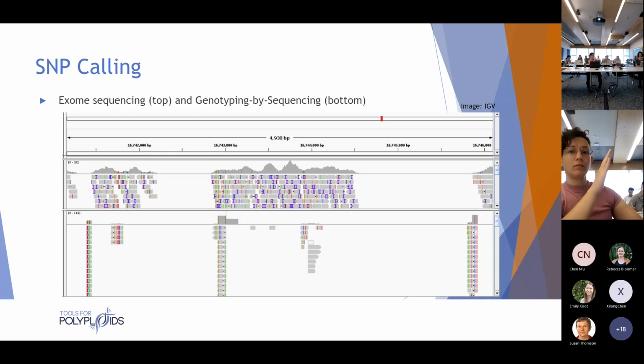What happens is there will be overlapping sequences, but only at the enzyme cut site, and they will be very close to each other. They will be considered duplicates because they start and end in the same position. This is important information because it will need to be handled differently compared to the other processes. In the other ones, the reads don't start and end in the same position, so they are not duplicates, and usually the duplicates are removed from the process. For GBS data, we can't do that. It's something that we will see later.